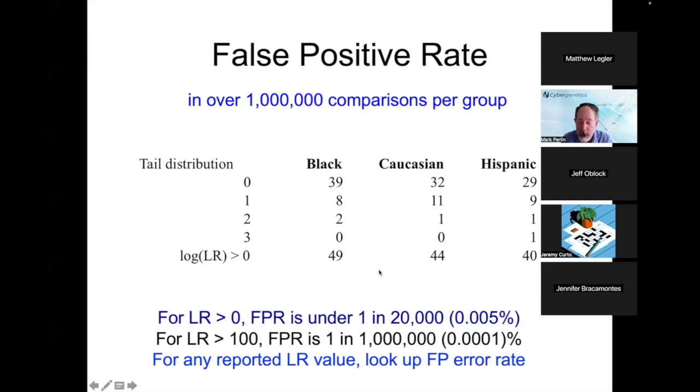We updated these slides to put a lot in today, so we'll fix them up when we post them. And then bin 1 is numbers between 10 and 100, and we see how out of these 1 million comparisons, the number of people in the different ethnic groups. And by the time we're up to more than 1,000, we're seeing virtually no error.